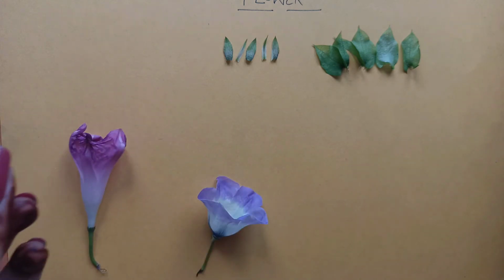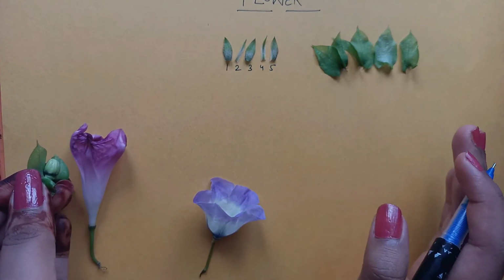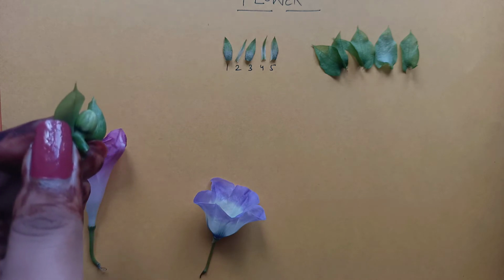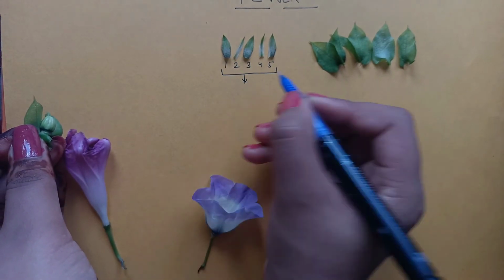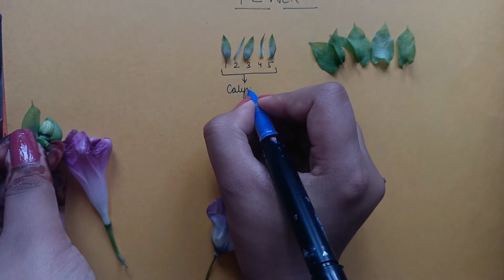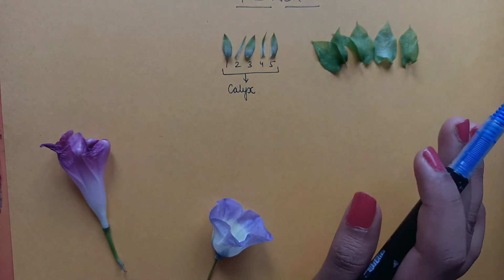Now one more important thing: this is one sepal, second, third, fourth and fifth. Usually you will find 5 sepals, but it varies from plant to plant; usually there are 5 in number. And this whole whorl, all the sepals together, are known as calyx. What are they known as? They are known as calyx. Is it clear to you that all the sepals together are known as calyx?